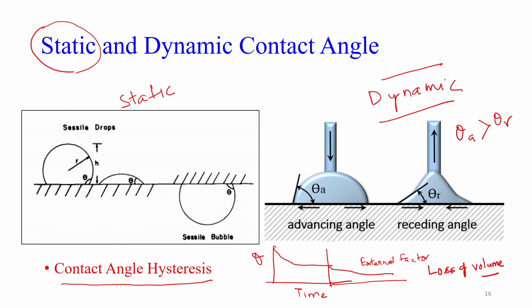This dynamic contact angle or contact angle hysteresis is helpful, because it says that it is a metastable state, it is not in equilibrium, that is why the contact angle is changing. At the same time, it also gives information about some physical or chemical heterogeneity of the surface. Physical heterogeneity may be a rough surface, or some air trapped on the surface.